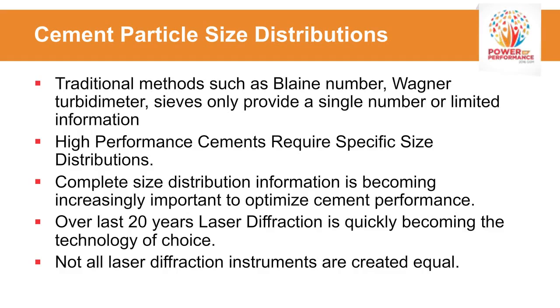The complete size distribution has been increasingly important, and so over the last 20 years or so, technology advances have been moving toward the laser diffraction type instrumentation for a variety of reasons that we'll get to in a moment. But one thing you want to consider is that not all laser diffraction particle size analyzers are created equal. They may be based on laser diffraction, but how you implement and design everything from sample handling to optics will contribute to the quality of the results you get.